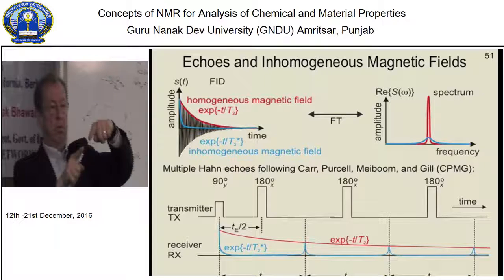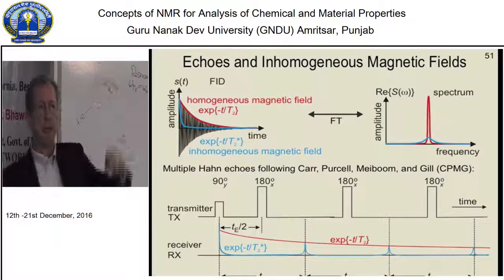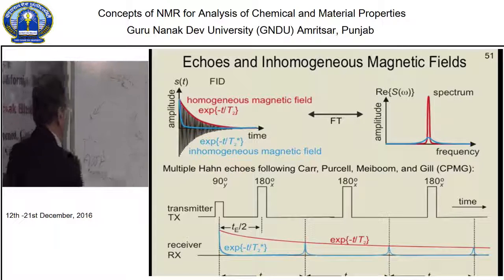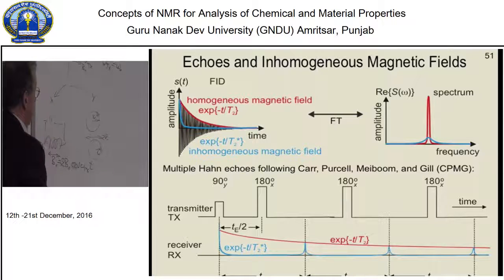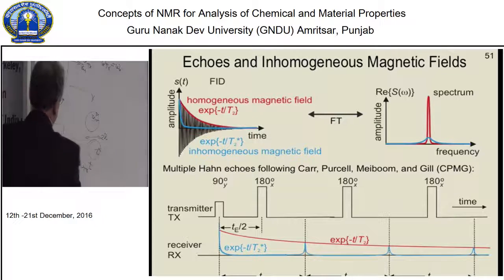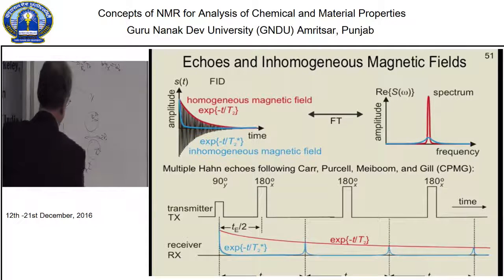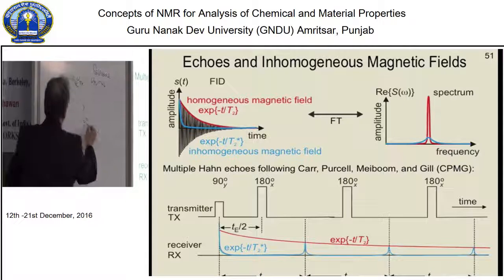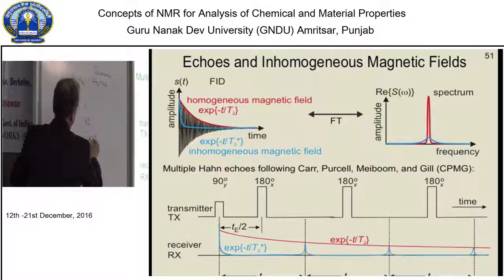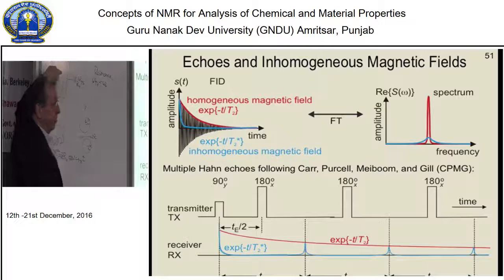So that's the rotation you need to do. I hope I do this right, this is complicated. And this is the explanation how the signal adds up according to Euler's formula. So in other words, that magnetic field which oscillates linearly, this field, is decomposed into one that rotates this way, and one that rotates the other way. So this one here rotates in the same direction as the spins, and can couple to the spins. That one doesn't.